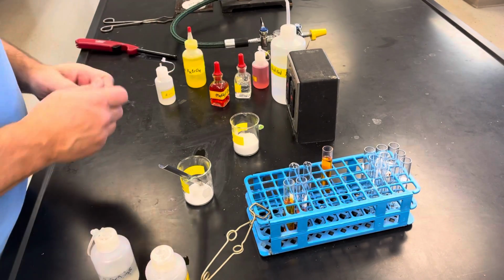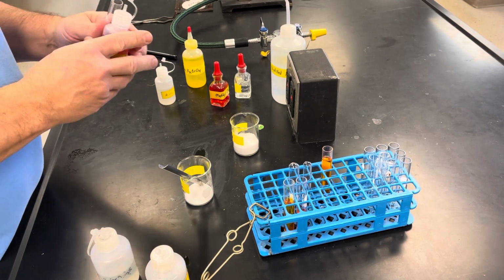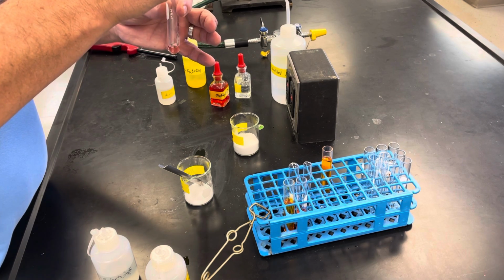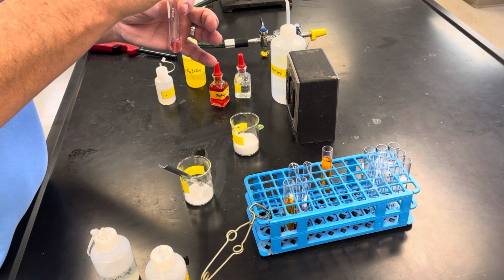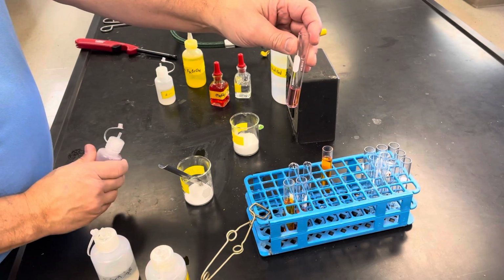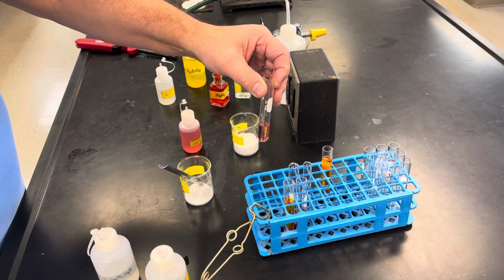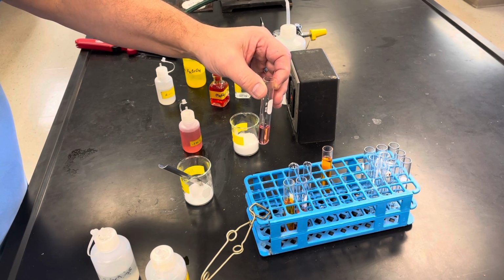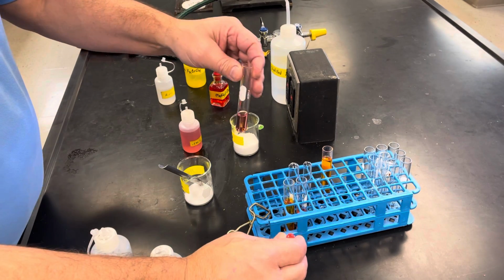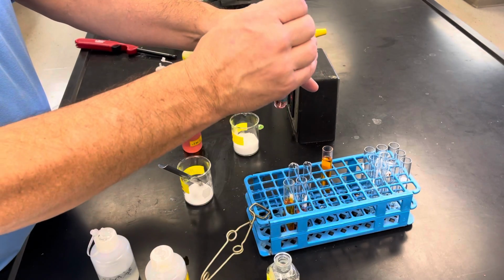I take some of my pink cobalt 2 and I get my 3 milliliters in here. Okay, so there's my 3 milliliters or so. And then it says, pour 3 milliliters into a beaker, add concentrated hydrochloric acid. Now this is a very dangerous, strong chemical, but we're going to be careful with it. And I'm going to add this. And I'm going to have to add a decent amount.